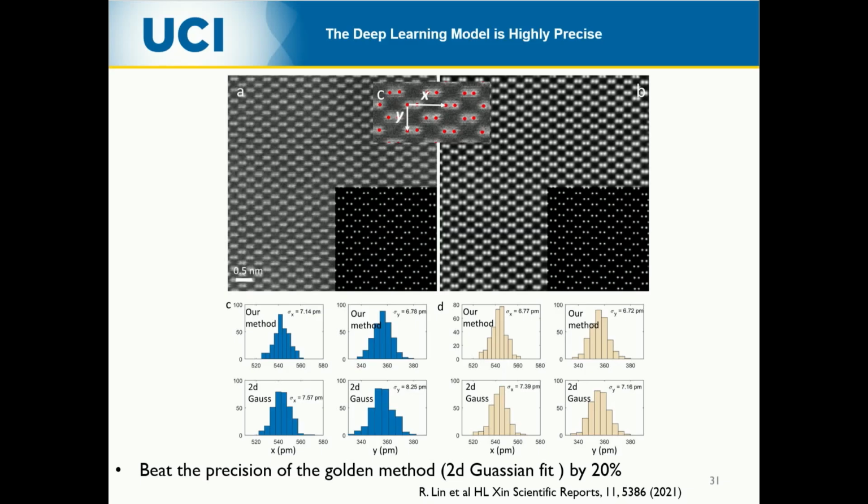These are the surface atoms. I want to find their location. I want to find out the strain. I want to do quantitative analysis on them, right? I had a problem using an old method to actually give us segmentation of the surface atoms. But here it achieves that. It's so nice. And the next thing is, what's the precision of the method?